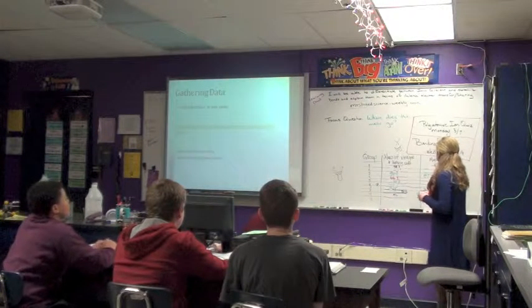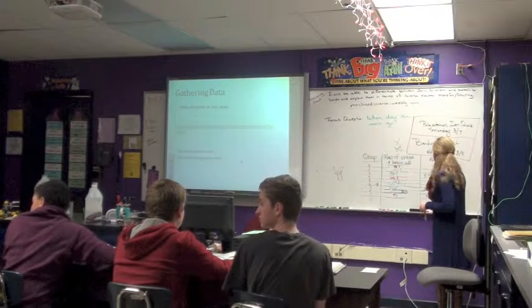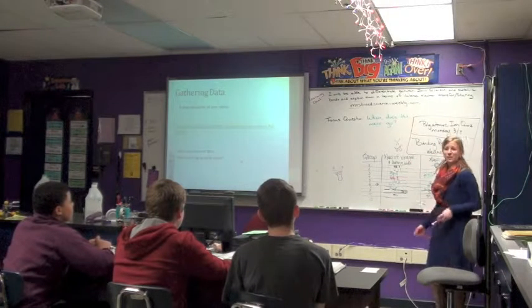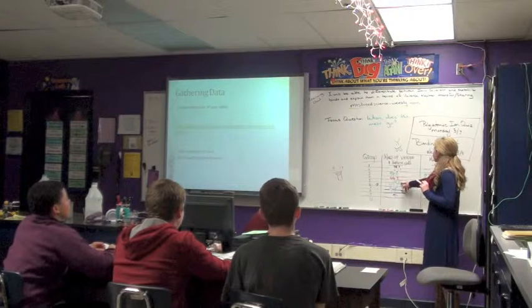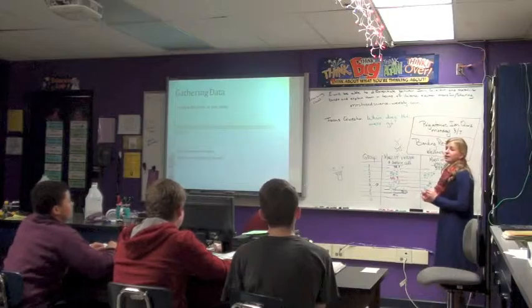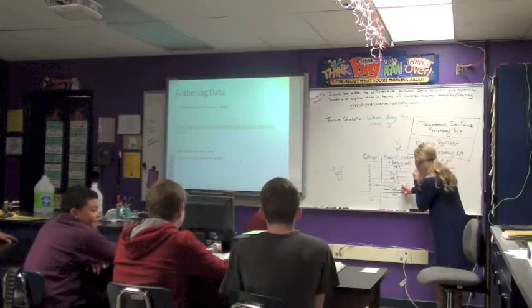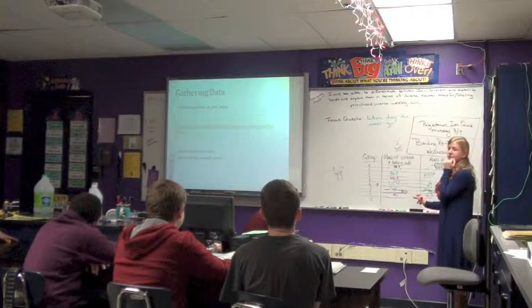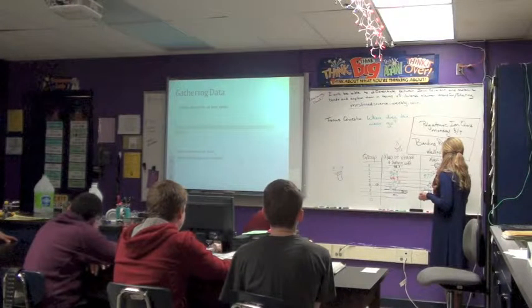Okay, I think this group forgot to write their final mass. Is it down one? No, this is one that exploded. Oh, you're right. I'm sorry. Yes, theirs exploded, so we don't know. Okay, so this one went from 50.8 to 39. So that one definitely decreased. So this one went from 49.1 to 47.3. So we'll say that it stayed the same because that's only about a 2 gram difference.